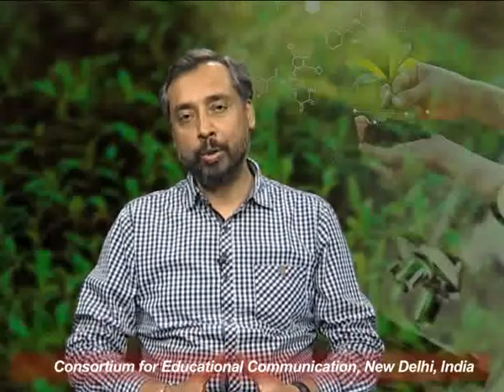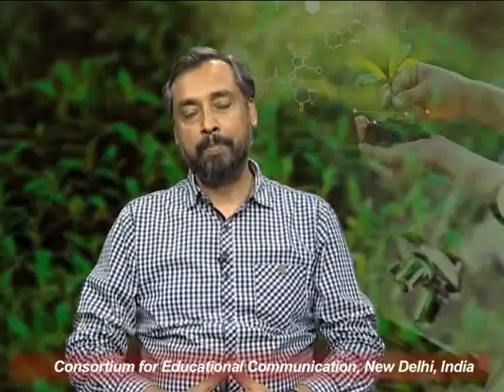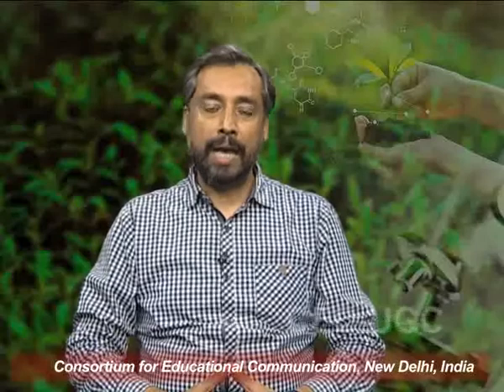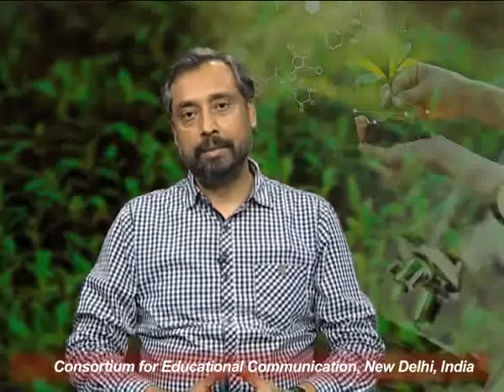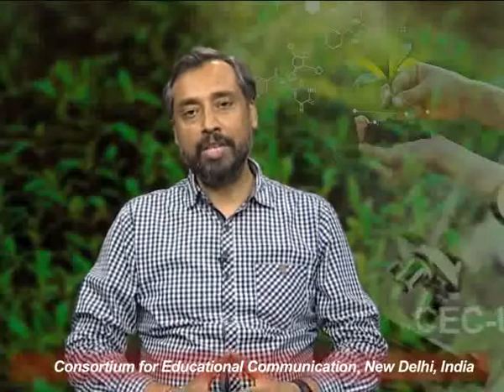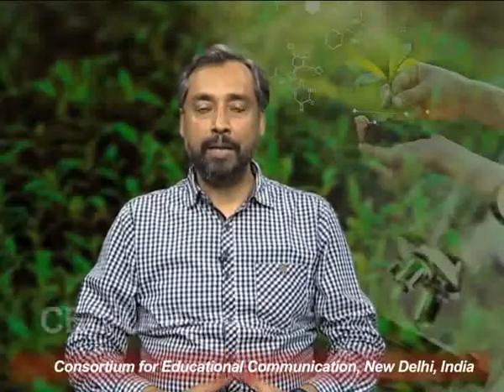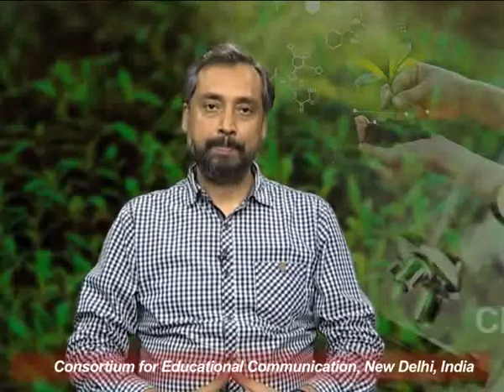We have also understood the functioning of light microscopy, confocal microscopy, and various different types of phase contrast microscopes and other light microscopes. Today, we shall continue our journey of microscopy by moving ahead, and today we shall be discussing electron microscopy.